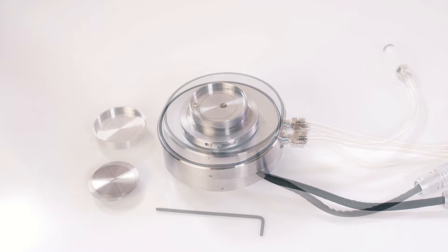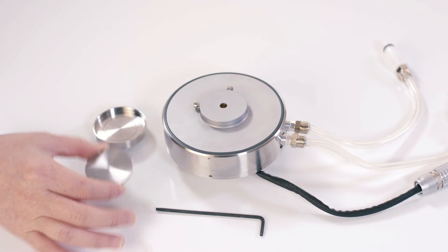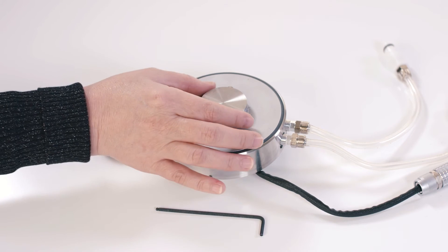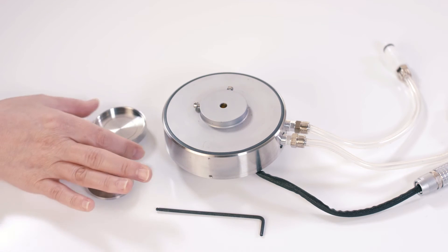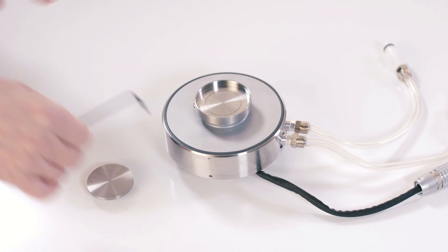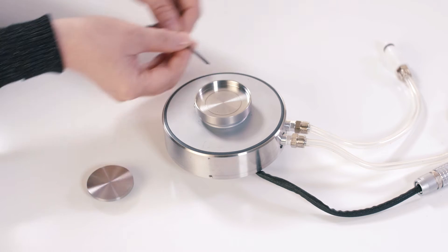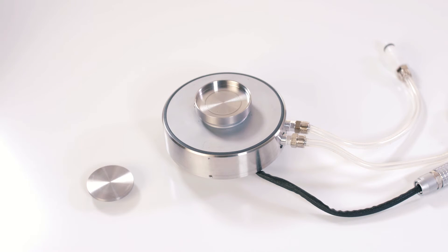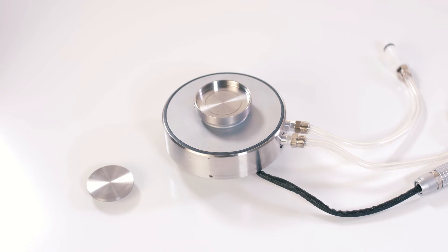For disposable Peltier users, you can directly insert this disposable plate or this cup to the Peltier. After that, install this Peltier to the bottom of the rheometer.